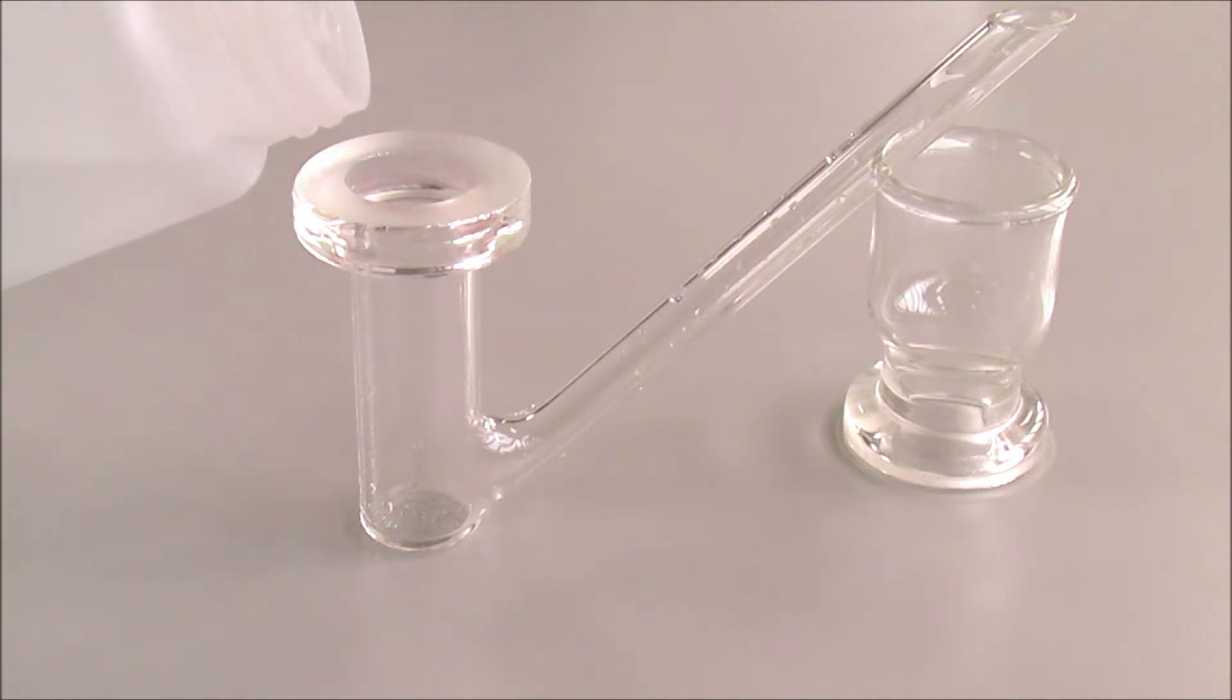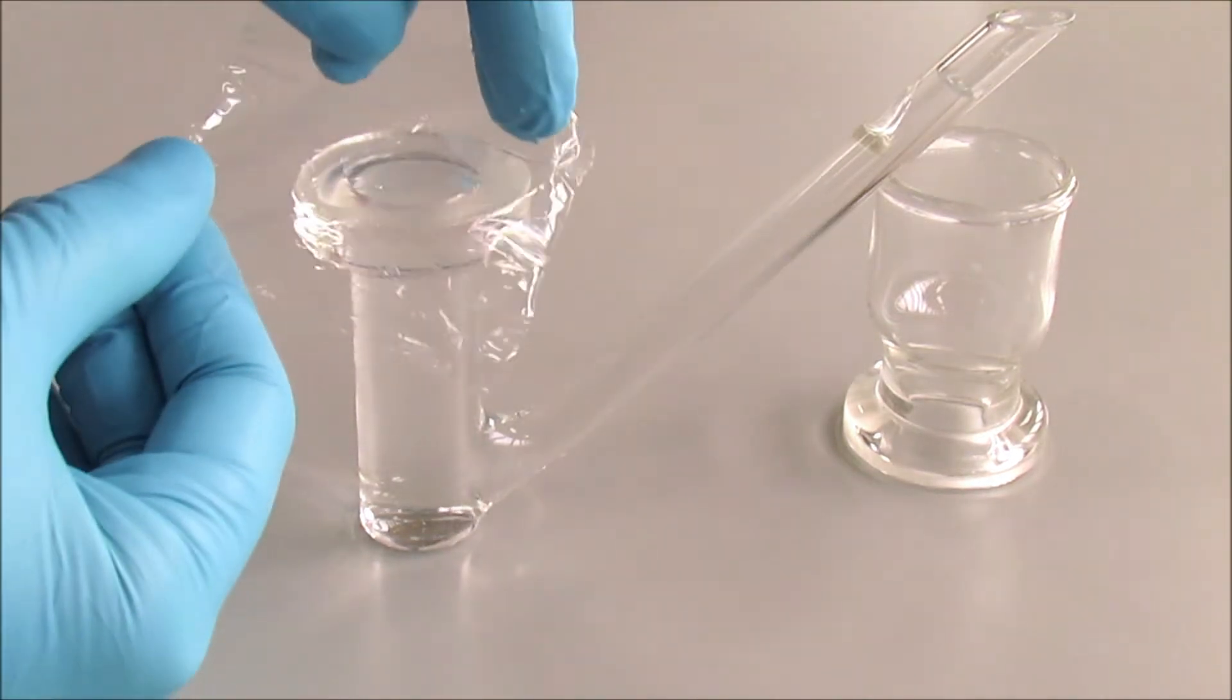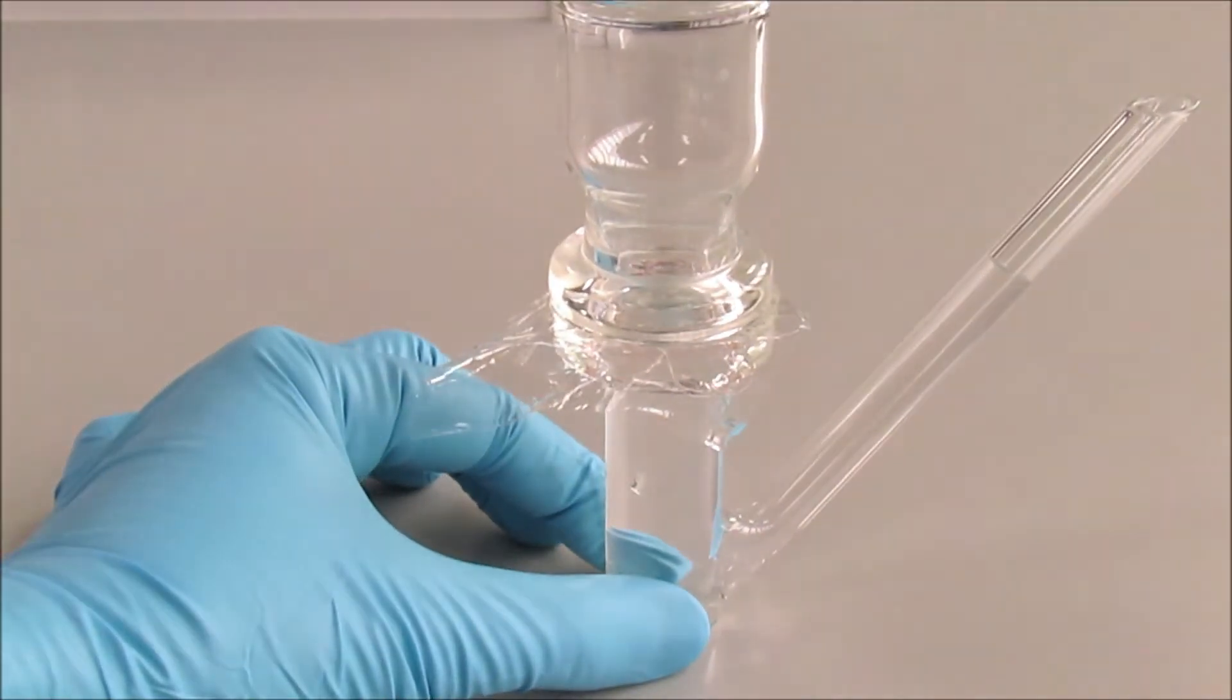So that's the way you fill up the receptor compartment, place a membrane, put a donor compartment on, making sure they are aligned, and then clamp them together.